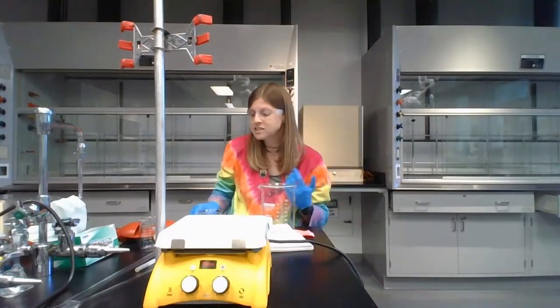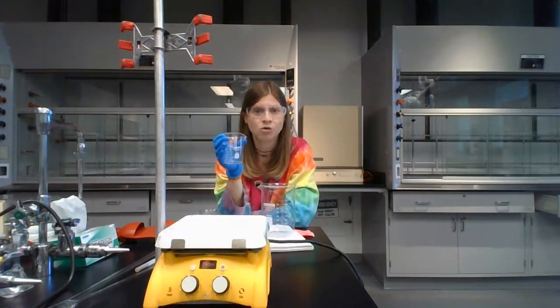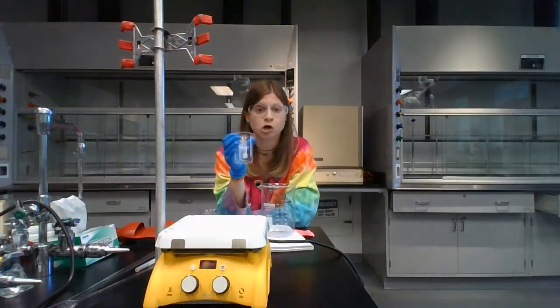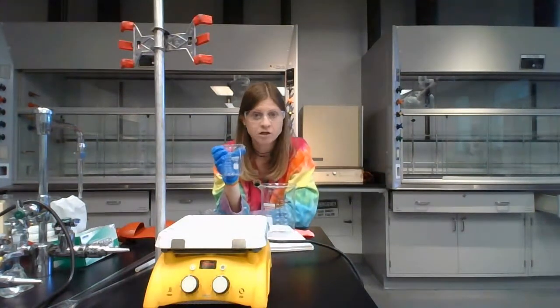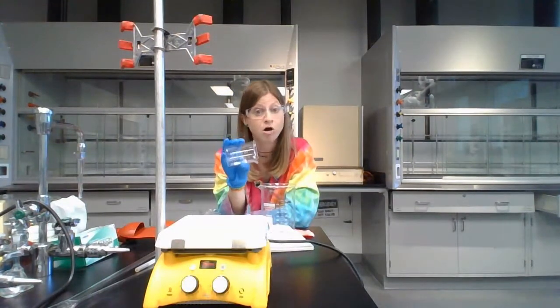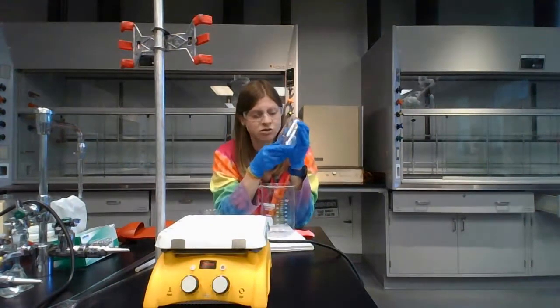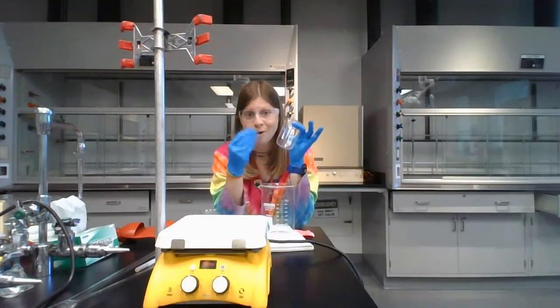Then take your waste beaker with the pure purple potassium permanganate in it and dump it into the designated waste container that says pure purple potassium permanganate only. So it's only the purple stuff, the dark purple stuff. You will go over to the waste container and dump all of your pure purple stuff into that. And when you come back, that beaker is still going to have some purple contaminants in it. We need to get rid of that.